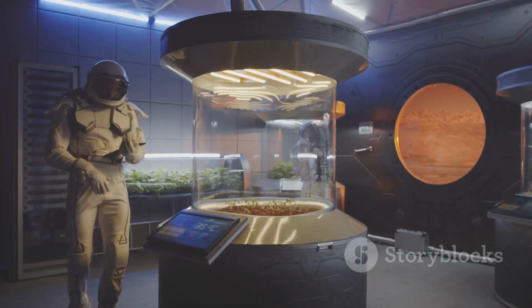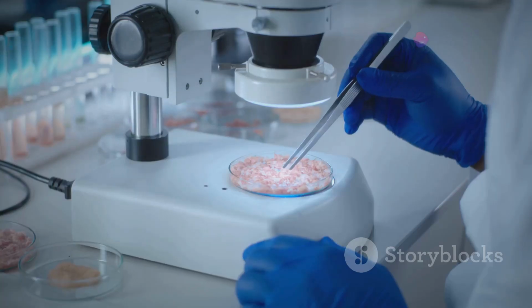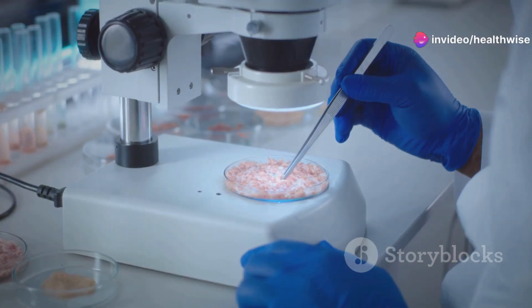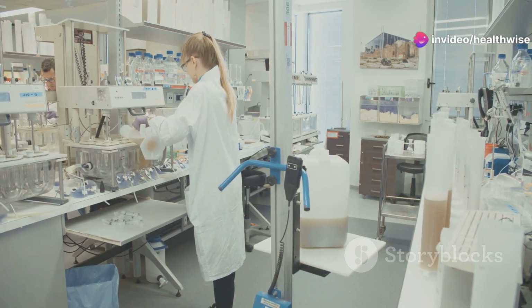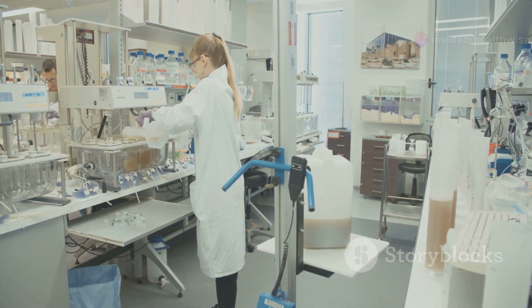Tissue culture is another important use of incubators. Researchers grow tissues to study their structure and function. This research can lead to breakthroughs in regenerative medicine and organ transplantation.